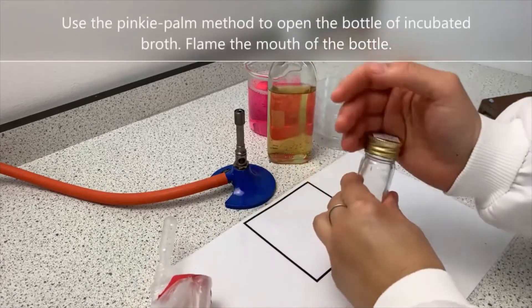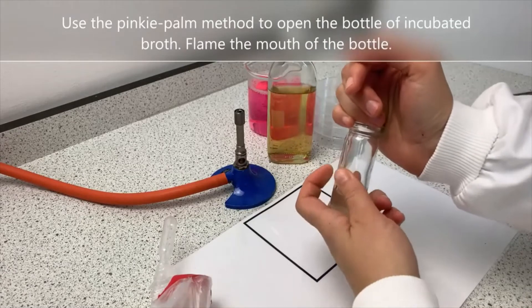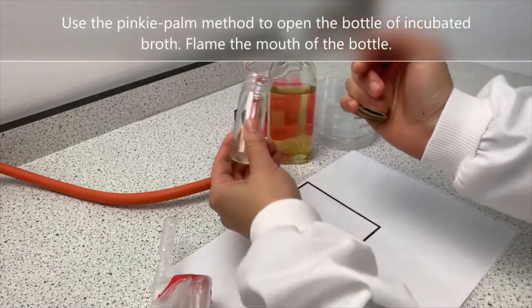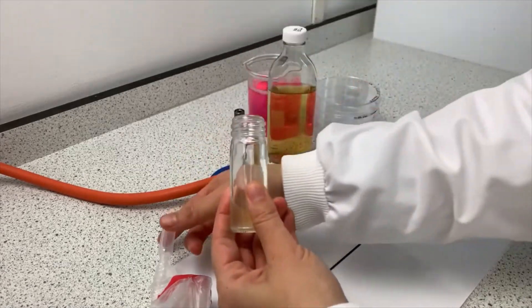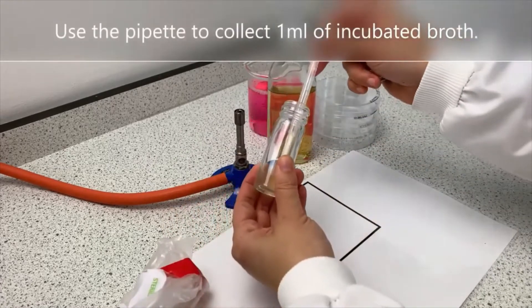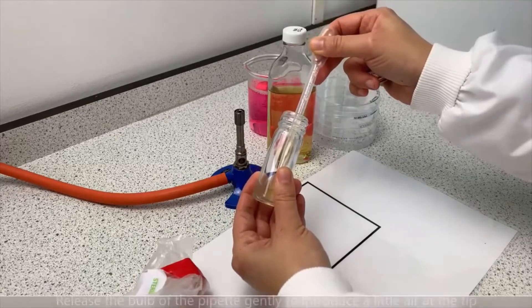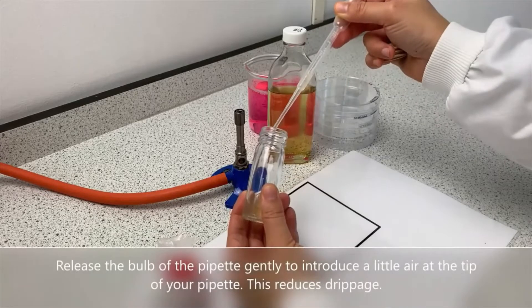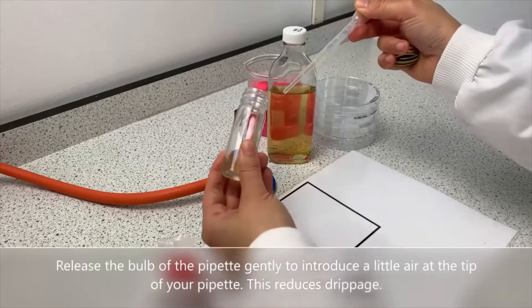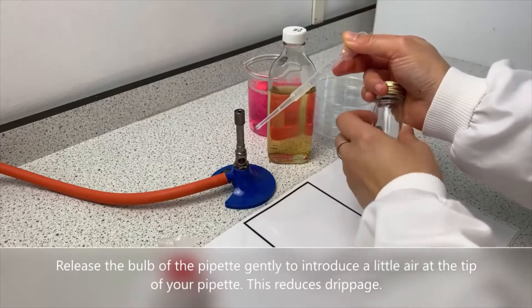Use the pinky palm method to open the bottle of incubated broth, then flame the mouth of the bottle. Use the pipette to collect 1ml of incubated broth. Release the barb of the pipette gently to introduce a little air at the tip of your pipette — this reduces drippage.